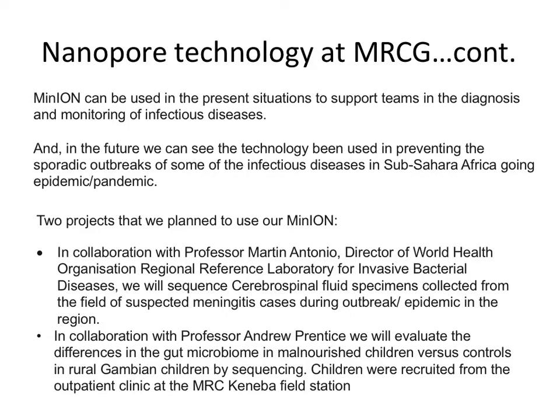I mean, when you're thinking about monitoring infectious diseases or looking at an outbreak, and I will come back to the one small project that I did with Martin if he was here. One of the things that happened, and it's really nice that Eben is here, is that there's an issue when you're trying to collect samples in the field and do microbiology. You go through a huge risk of getting experts to the field. They get samples, they collect, they try to grow. There's an issue about the infrastructure in terms of how they will store samples. Then there's also an issue about how you bring those samples to Gambia, where you've got your technology, or somewhere in Europe. It's a huge task, and I wouldn't say what the pitfalls of it are. Maybe Eben over lunch will tell you what issues they are.